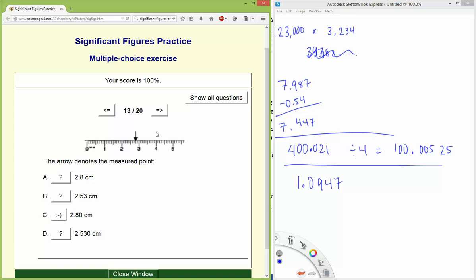So that's normal standard operating procedure? Yes. You might have some places, as I said at the very beginning, that might disagree, and you just report to what you have tick marks for, but if you're measuring with your eyes, it's standard to go up to what you have and then one more decimal. Now if you have a digital scale, you're not going to guess. You just report what the digital scale tells you. Or you have some kind of micrometer with a certain amount of precision dialed into it, you just go with that. But a lot of times with rulers or measuring volumes with burettes, you go up to the markings that are there, and then you guess the last decimal.